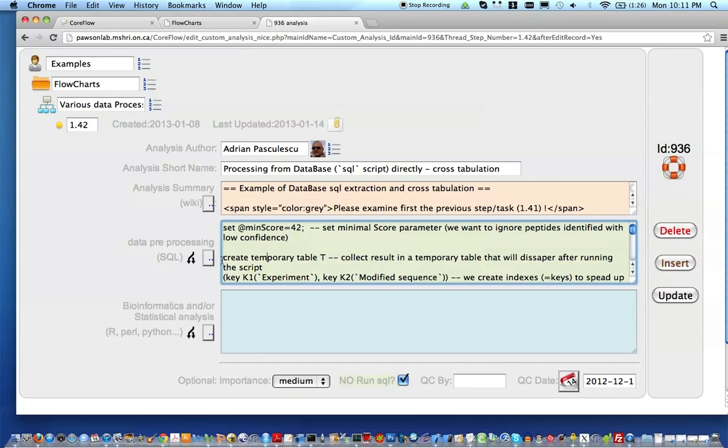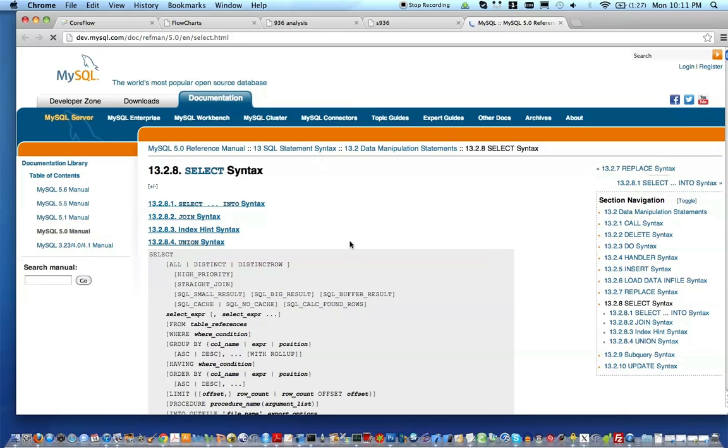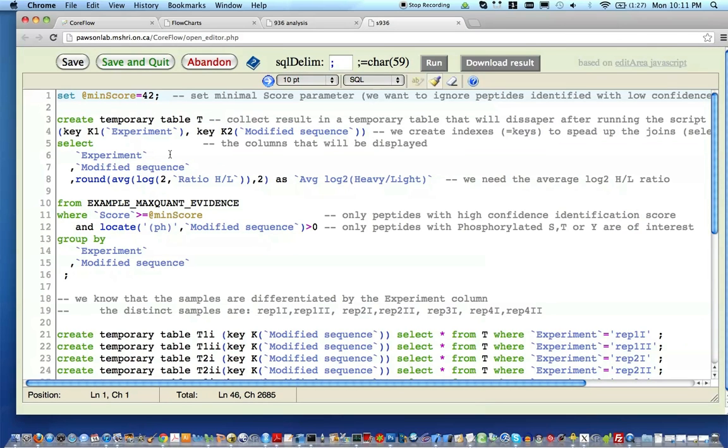The second area here, a bit green, is dedicated to database management. It has a special language, SQL, structured query language. Again, this is presented in colored syntax. If somebody wants to know more about the syntax and the grammar of that language, they can click here to obtain a hyperlink. As usual, you can change something here on the fly. You can add, for example, "this is my comment", and you can obviously save it and you can run it.